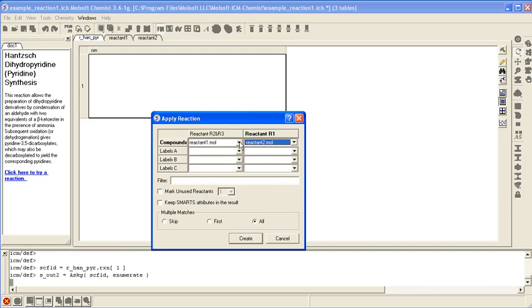Go ok. Then the reactants for R2 and R3 are in table reactant 1. The reactant for R1 is in table called reactant 2. Just go create.